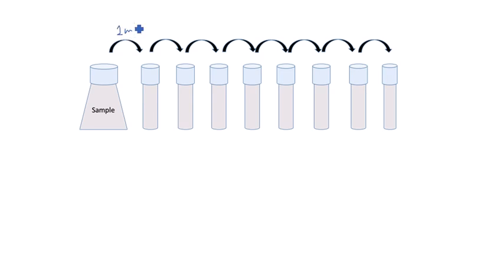So this is 1 ml in 9, 1 in 99, 0.1 in 9.9, 0.1 in 0.9, 1 in 9, 1 in 99, and then 0.1 in 0.9, and then 0.1 in 9.9.